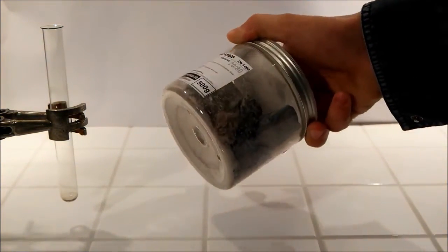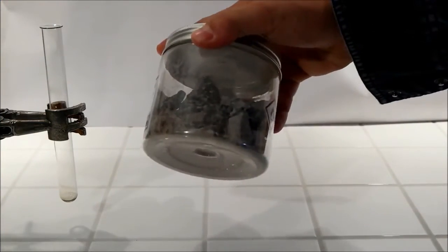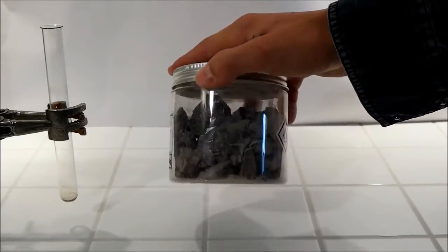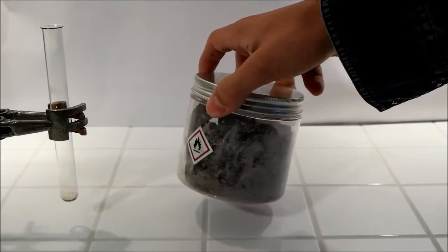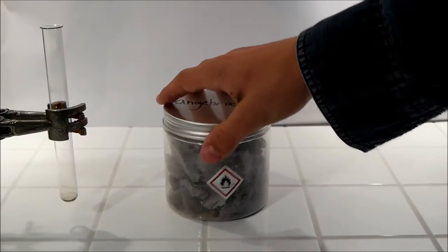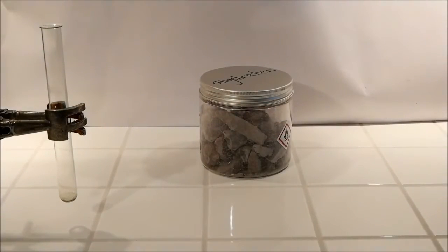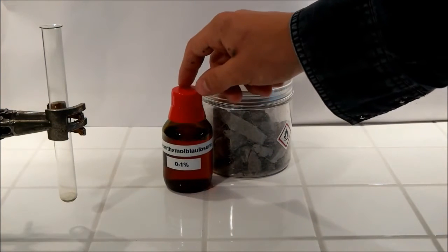So this calcium carbide is normally white crystals, but I could only buy it in those gray chunks, or those nuggets. I got this 500 grams for €5, and if you put it together with water, okay, there's ethine, but there's also a salt produced, which is calcium hydroxide, and this is a base, of course, and our Bromthimol blue solution will show us that it's a base.